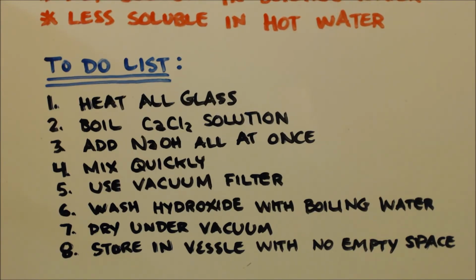This is what happened. Now when I poured the hydrochloric acid into the frit filter to clean it, there's a little bit of stuff you can't scrape out of the hydroxide, right? But when I put it in there, I could not hear any snap, crackle, pop at all, not even one fizz. The acid still hasn't gone through the frit filter because it's all caked with that hydroxide.